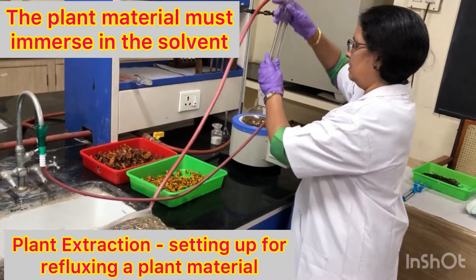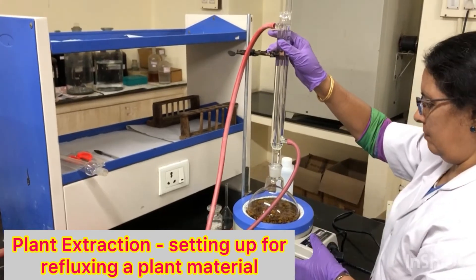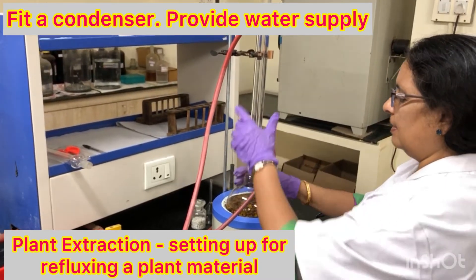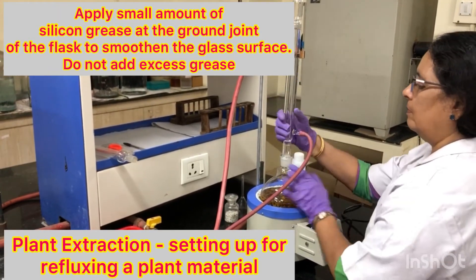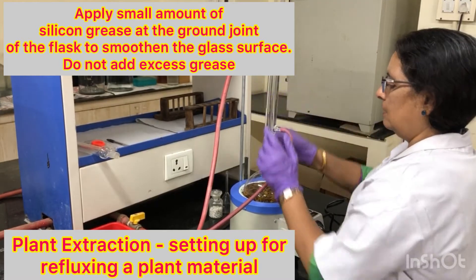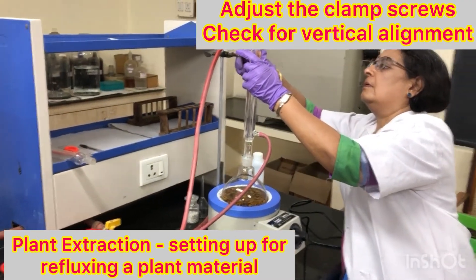I am fitting the condenser onto this flask. You can add a little silicon grease here — not too much, just slightly a bit of it — to smoothen the joints. You must not use too much of the grease.